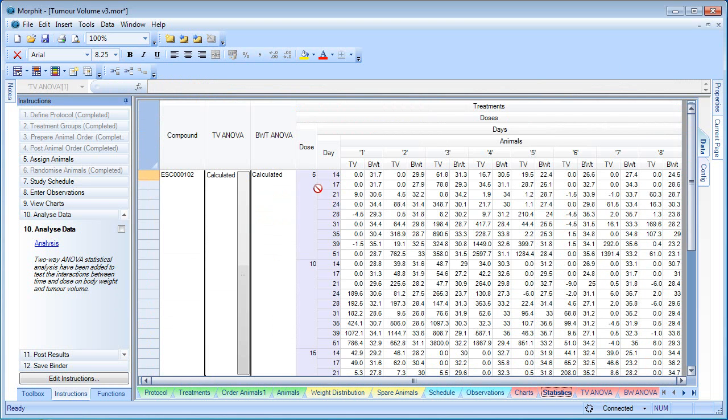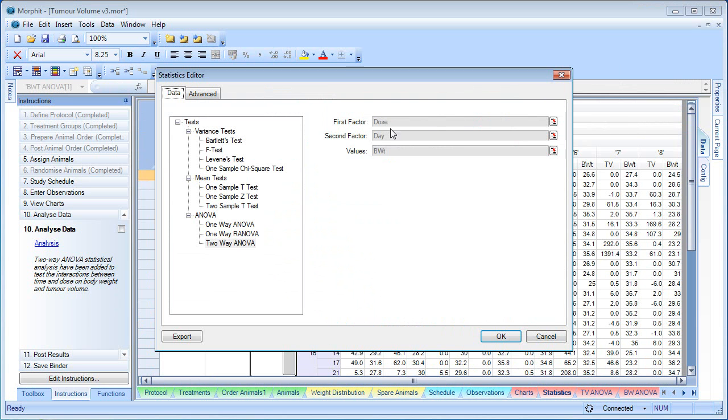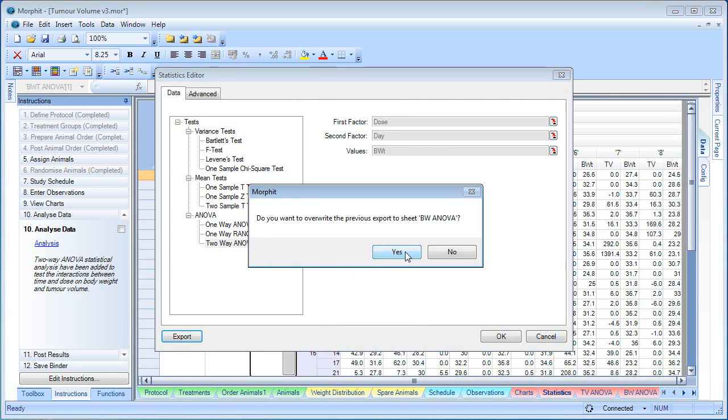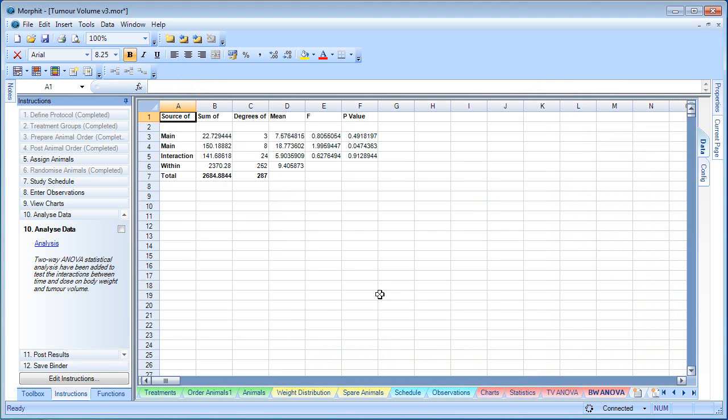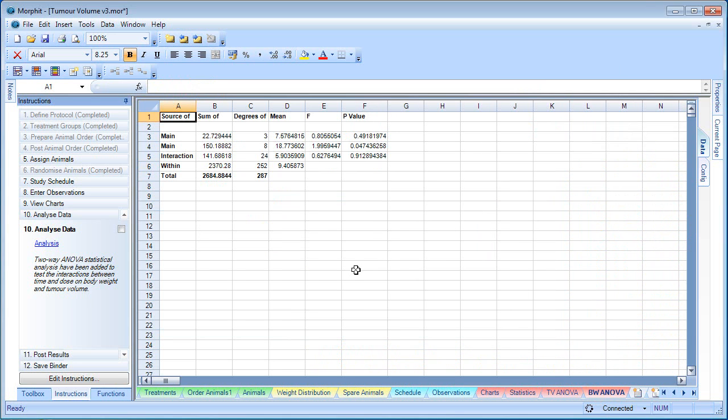If we go back to the statistics, we can do the same for body weight. Dose and day. So we now have our data.